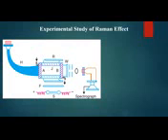effect. This experimental setup consists of a glass tube AB. In this glass tube, the experimental liquid is placed. The Raman spectrum of the liquid has to be taken, and that particular liquid has to be placed in the glass tube. This glass tube is closed by an optically transparent window W on one side, and on the other side a horn is connected.